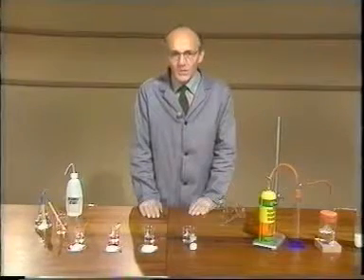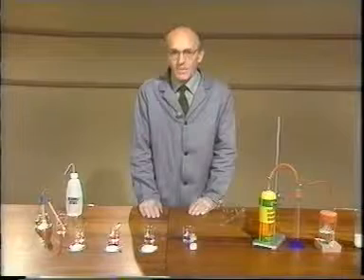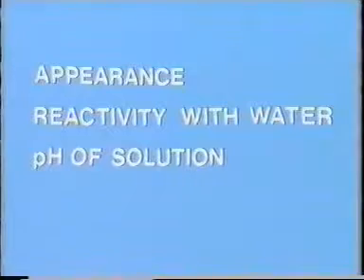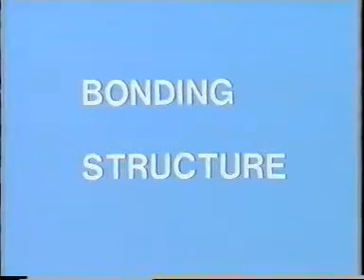Now I'll do a similar series of experiments for the oxides of the elements. Again, you should note down the appearance of the compound at room temperature, its reactivity with water, the pH of the solution, and the solubility in hexane. This will help you to reach conclusions about the bonding and structure in the compounds.